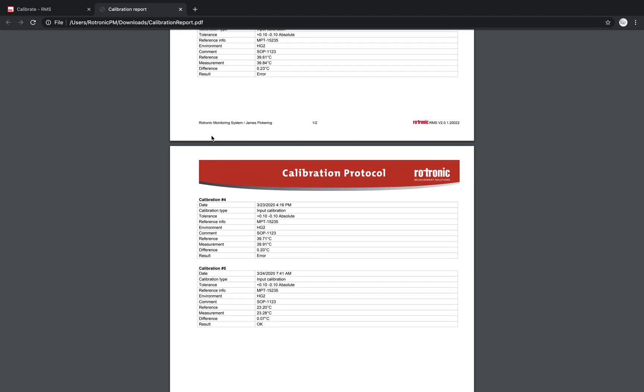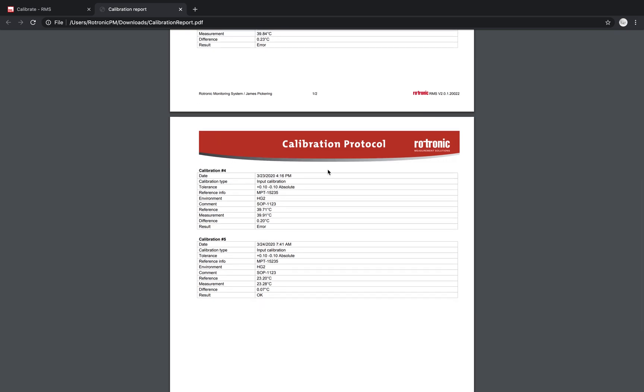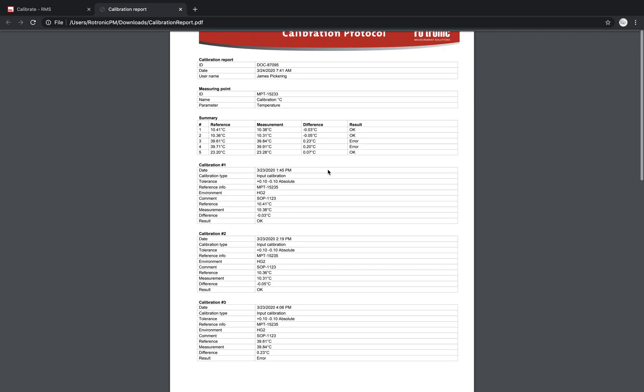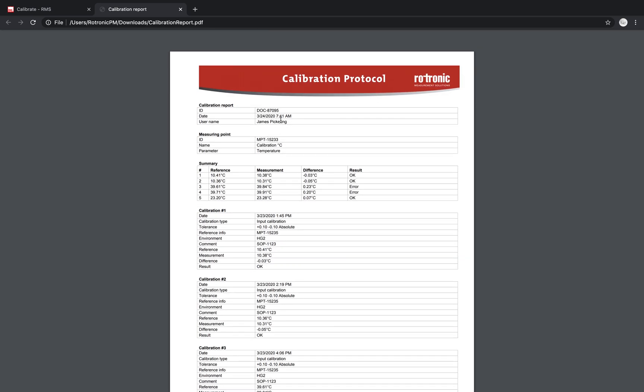So electronic record, electronic signature, we have the whole system set up here. So we know that James Pickering, for example, carried out this calibration certificate, made this calibration certificate on the 24th of the 3rd, 2020.